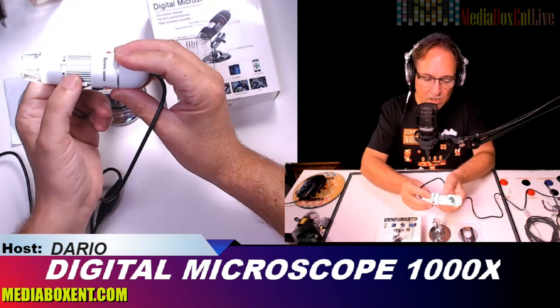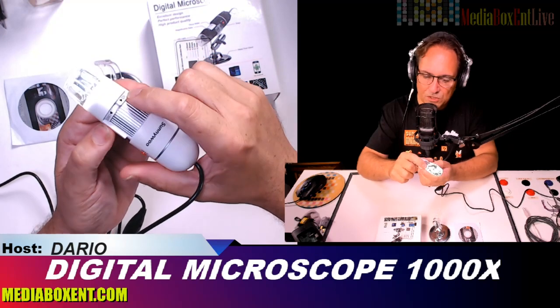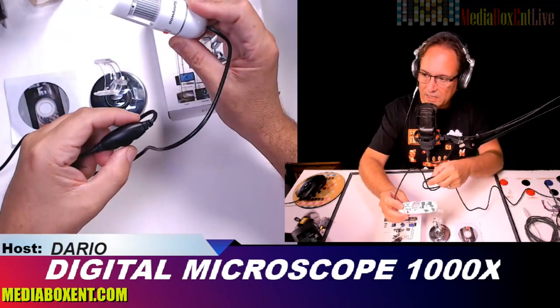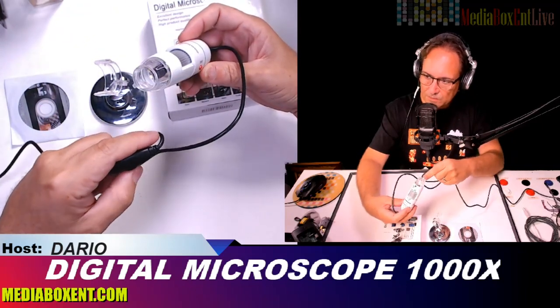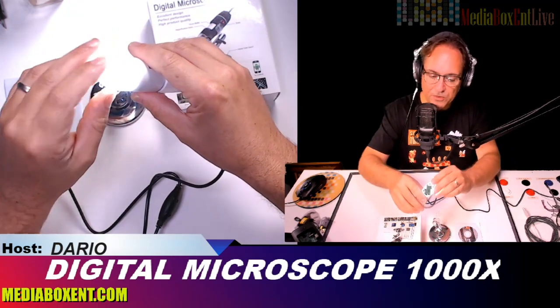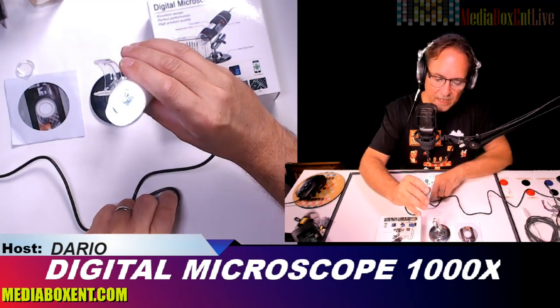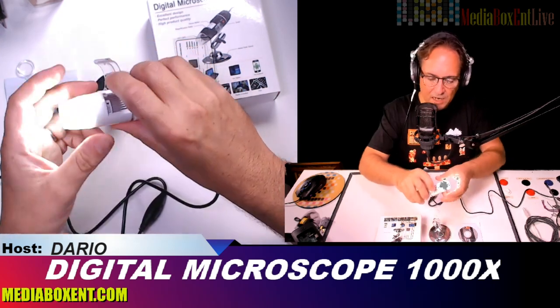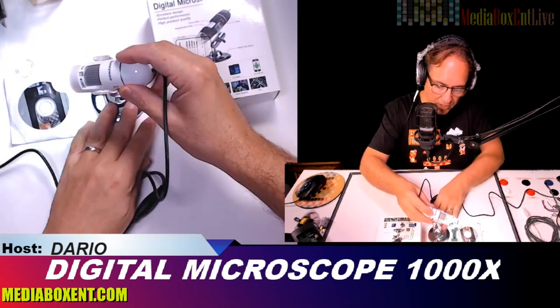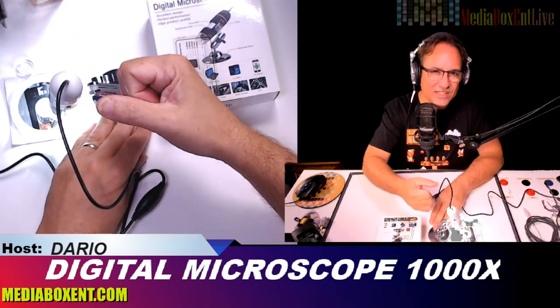Here we can change the zoom from 1000 times down to 40 times. We can take snapshots and zoom in or out. On the side we can change the lighting. It comes with a cap — after you finish, cover it up so the lens doesn't get dirty. It has eight LEDs, five times digital zoom, plus 1000 times optical zoom. You can place it on the stand or hold it in hand.